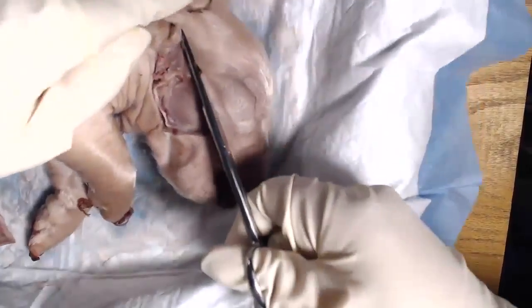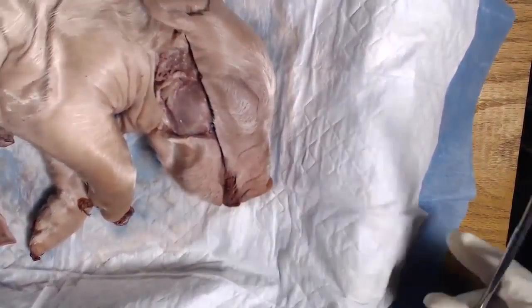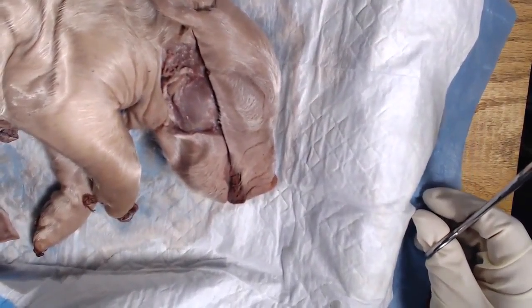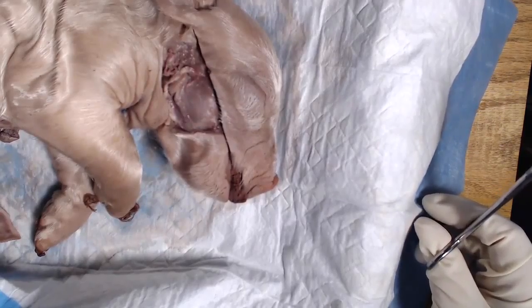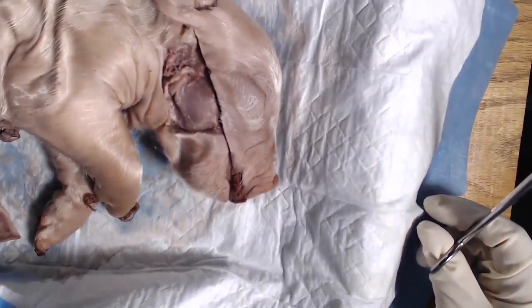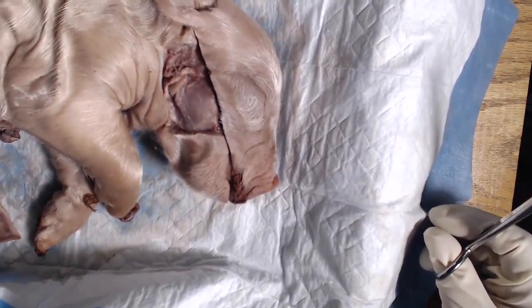I might extend it a little bit further, just like that. I'll give you all a second to do that. And then once we do that, we're going to have to flip our pig over, and we're actually going to make that same cut on the other side of its face.